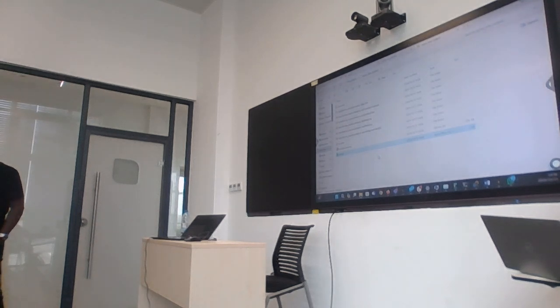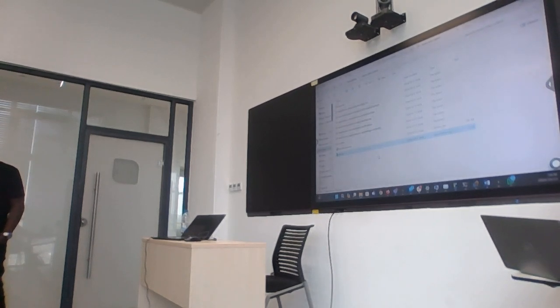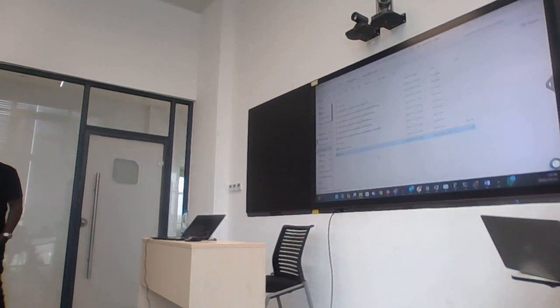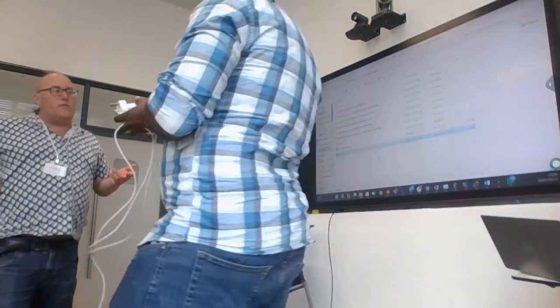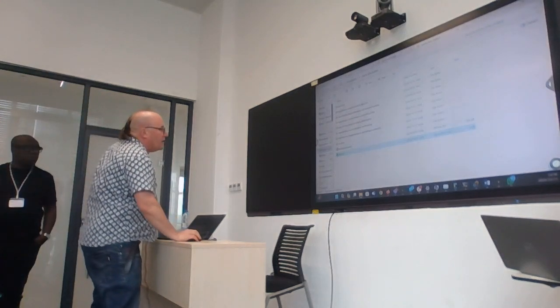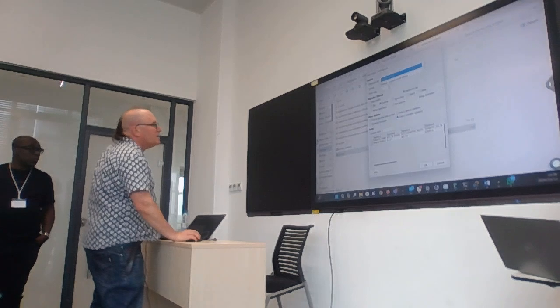Now, I have LibreOffice installed on my computer, so that is what opens comma separated value files for me. For people who have Excel, I don't know, I'm not an Excel expert. Can you open the CSV file in Excel? Yes. Okay. Which one do you live in? No, Excel used to have problems with this. You used to have to go data import and other weird stuff. Yeah.